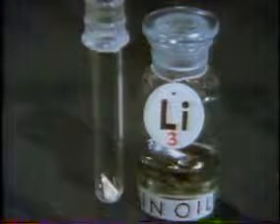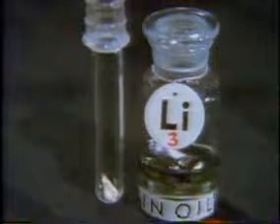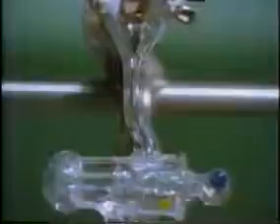You may remember something in air reacted with freshly cut lithium. Let's try the previously inert gases with lithium. Nitrogen was inert toward potassium. Look at the darkening area. Nitrogen does react with lithium. Nitrogen is not inert. Here are argon and lithium.